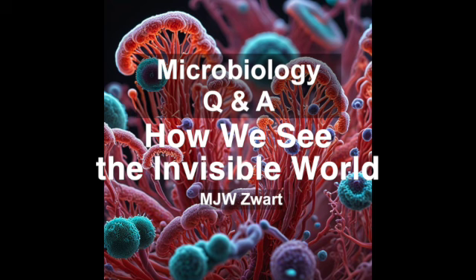But there are so many different types of microscopes out there. There are. Where do we even begin? Well, let's think of it as a family tree. The earliest microscopes, like Leeuwenhoek's, used just a single lens. But soon, scientists developed compound microscopes, which use multiple lenses to achieve higher magnification. So more lenses, more power. Exactly. And as our understanding of light grew, so did the sophistication of our microscopes.